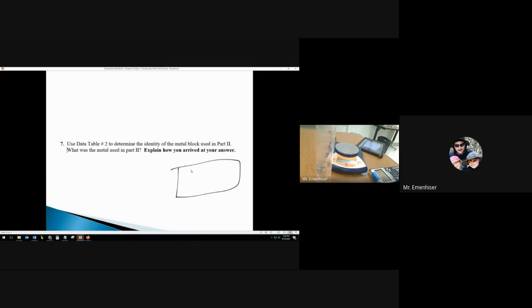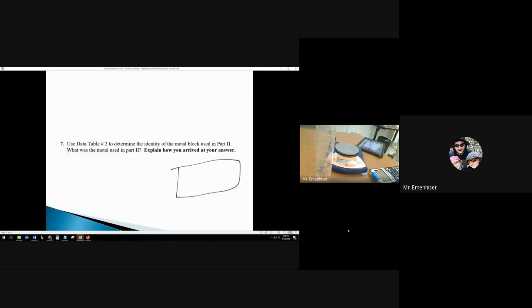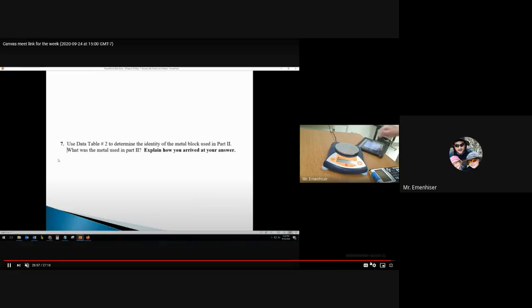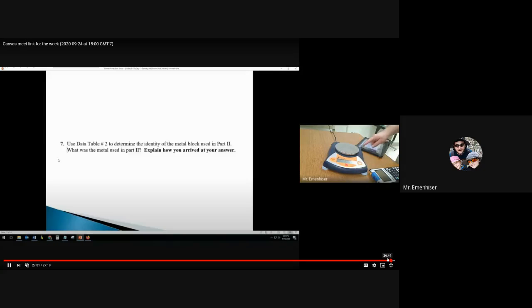Okay, what am I doing here? What are you doing, sir? Oh, I think I had to go get a napkin. I'm taking that cube out of the water. That's what I'm doing right now. Okay, so there's our cube. So try to figure out what that cube is. Okay. Come on, sir. Keep it moving.